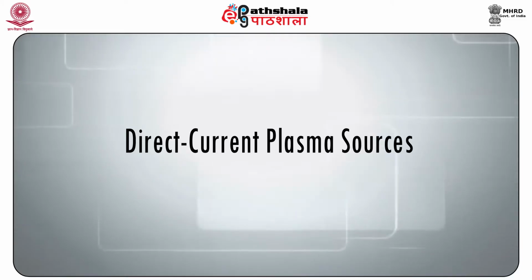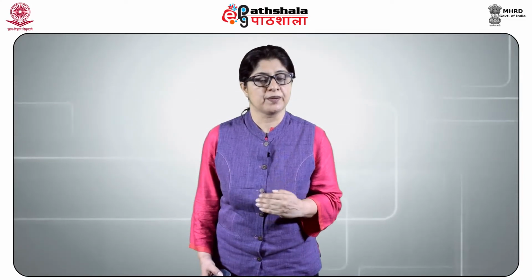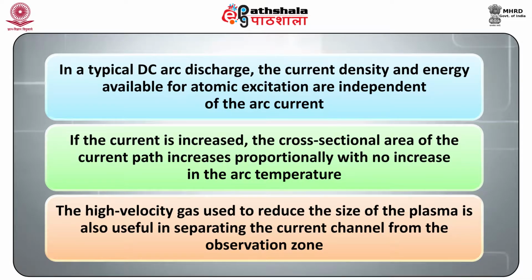Direct current plasma sources. In direct current plasma sources, a high velocity inert gas produces high temperature plasma and separates the excitation energy from the analytical observation zone. In a typical DC arc discharge, the current density and energy available for atomic excitation are independent of the arc current. If the current is increased, the cross-sectional area of the current path increases proportionally, but with no increase in the arc temperature. The high velocity gas used to reduce the size of the plasma is also useful in separating the current channel from the observation zone.